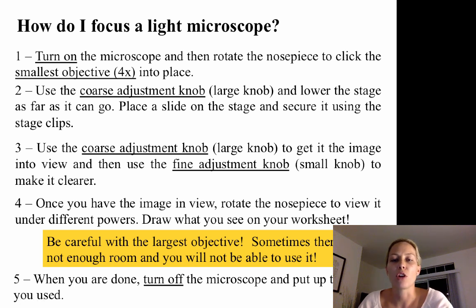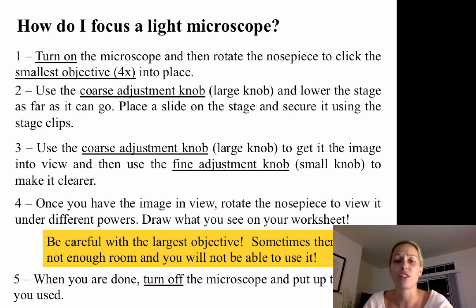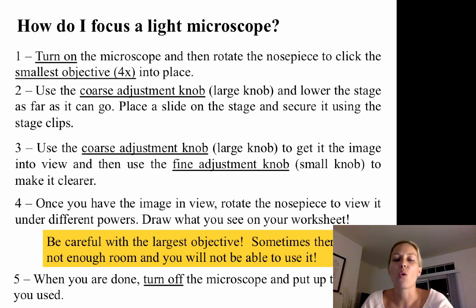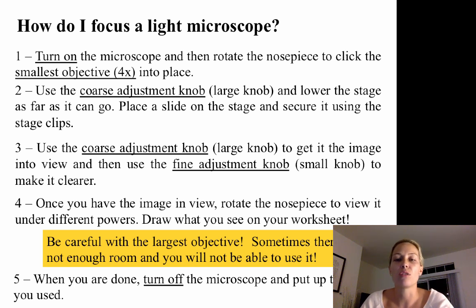How do you focus a light microscope? First, turn on the microscope. Then rotate the nosepiece and click it into the smallest objective, which should be the 4x. Use the coarse adjustment knob to lower the stage as far as it can go. Place the slide on the stage and secure it using the stage clips. Then rotate the coarse adjustment knob upward so the stage rises to meet the objective. Once the specimen is in focus, use the fine adjustment knob to make the image crystal clear and sharp.